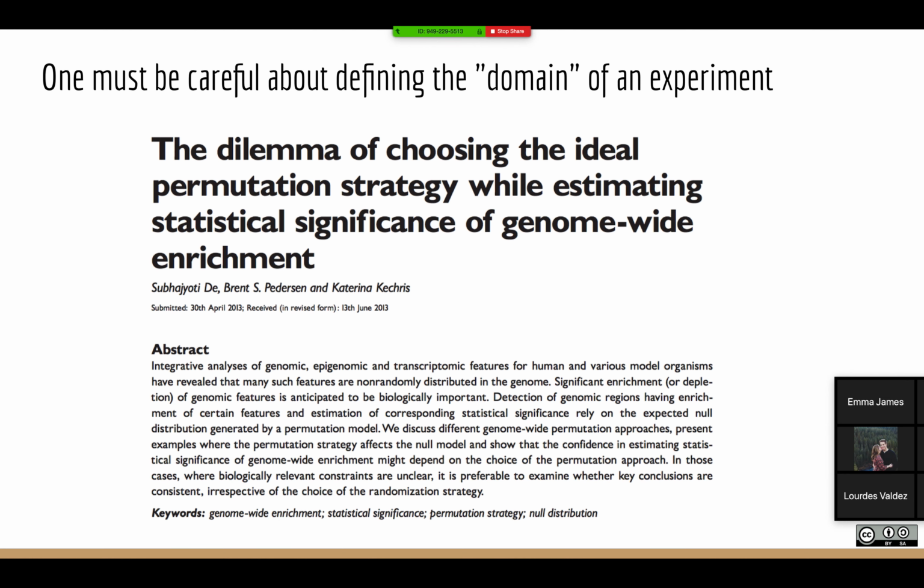The problem with this is Monte Carlo simulations make a fundamental assumption that is often violated in genomics, and that is that every nucleotide or every position is independent of one another. Let me say that again. The way to think about a Monte Carlo simulation is that each of the shuffles and the cards that you draw, in the case of blackjack, are totally independent of the previous card and of the next card. If you've got a good dealer and they shuffle right and they're not cheating you, that should be the case.